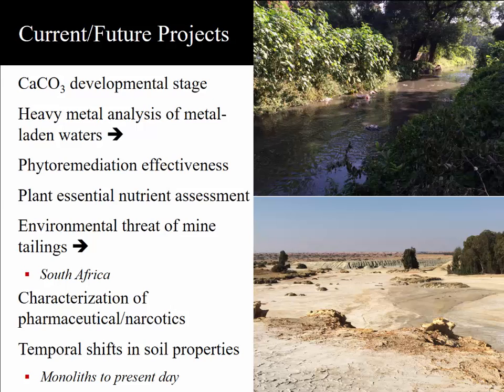And then also, I had an undergraduate student, Caitlin Heron, who just finished an undergraduate research project, and she collected samples near the Fort McMurray area where the tar sands are being mined. She brought those samples back to Virginia Tech, and we scanned all of those because her working hypothesis was that the processing at the tar sands to prepare the material to go into the pipeline to come south toward the U.S. was releasing contamination. So she studied a variety of sites down the prevailing wind direction from that plant, and actually did not detect any noticeable pollution, which was interesting.